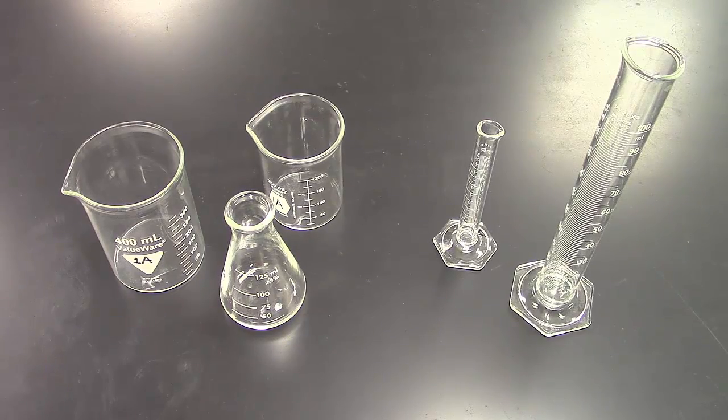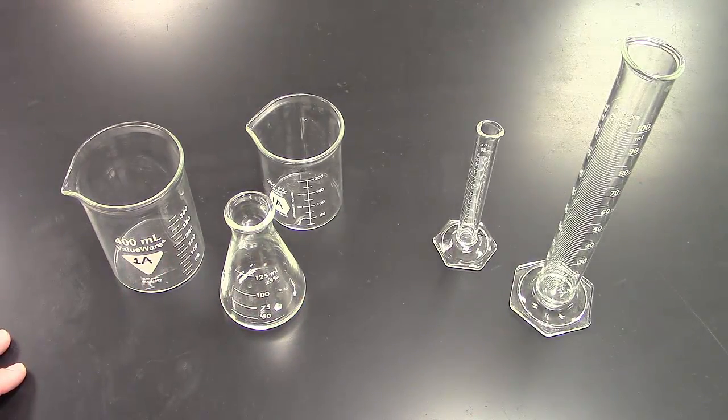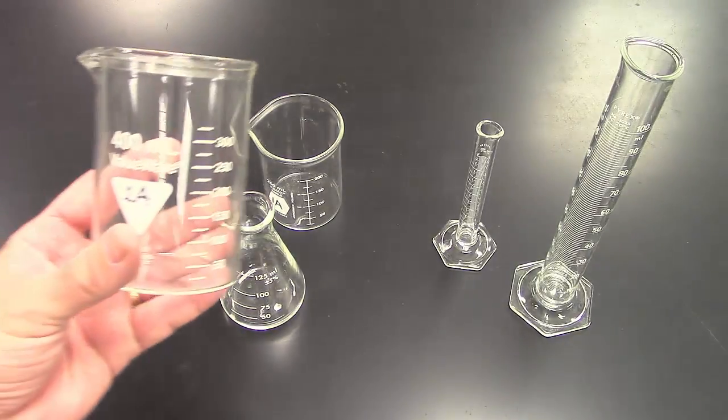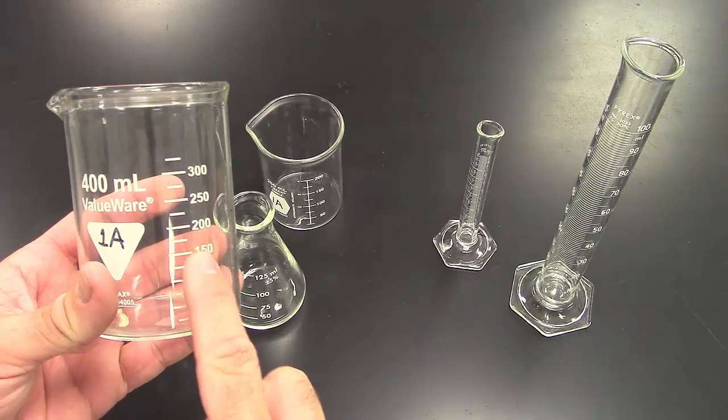Let's say in a lab situation, you need to measure out some water, and you wanted to have a precise measurement. You might say, hey, all of these glassware looks equally good at doing that. However, if we think closely, and especially what we know about significant digits, when you look at a beaker, you'll notice that there's increments there. However, the increments here are not on even levels.